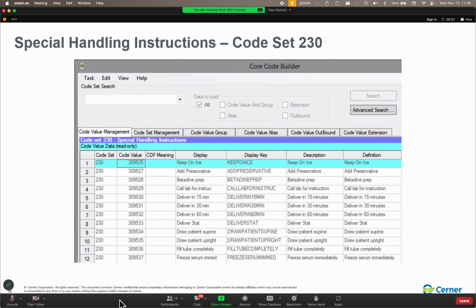With our max accession size of 12, here's what we need to know. Is the container ID in the barcode? Well, if I scroll over here to the right, third row up from the bottom, it's not printed. So we're not going to include the container ID in the label or in that barcode at all. It's not going to be in the label, it's not going to be in the barcode. So we don't have to worry about that.